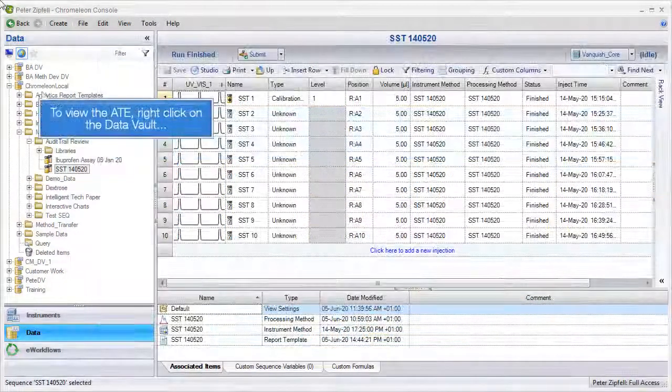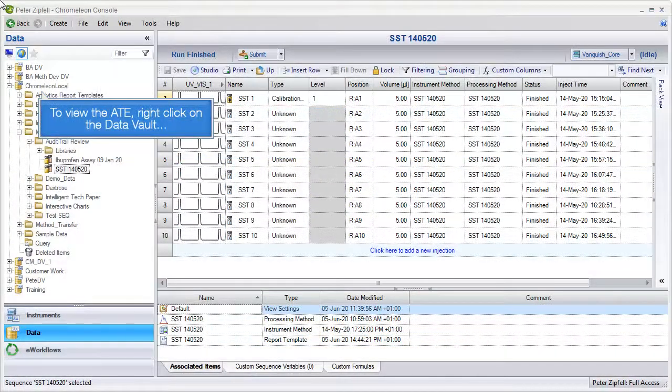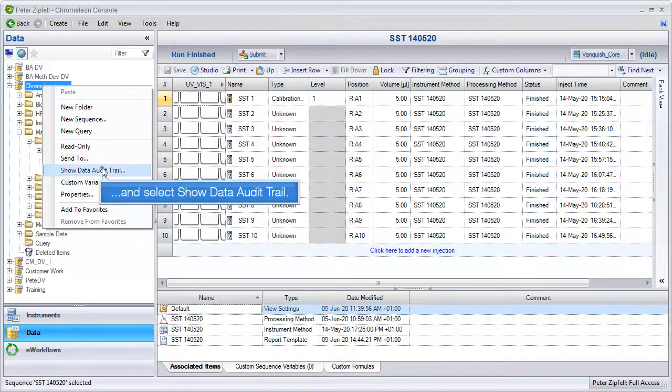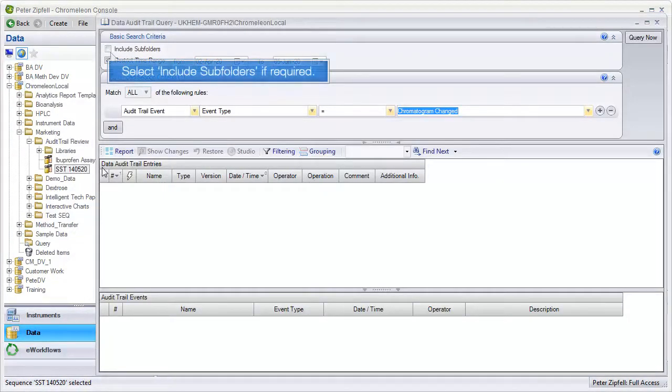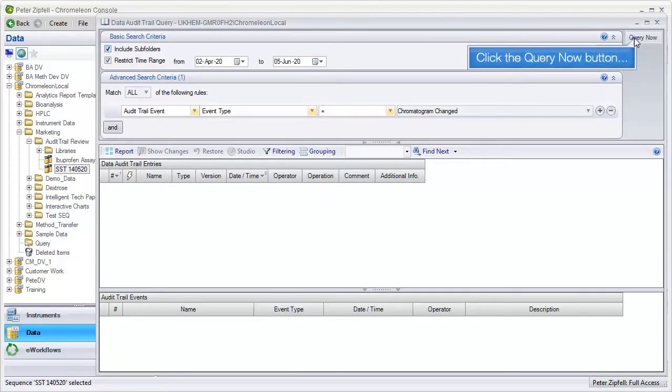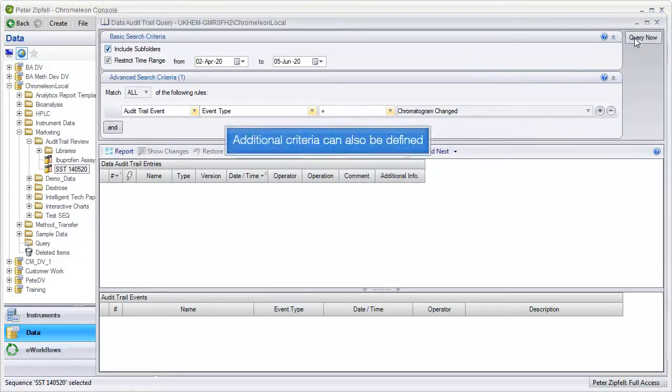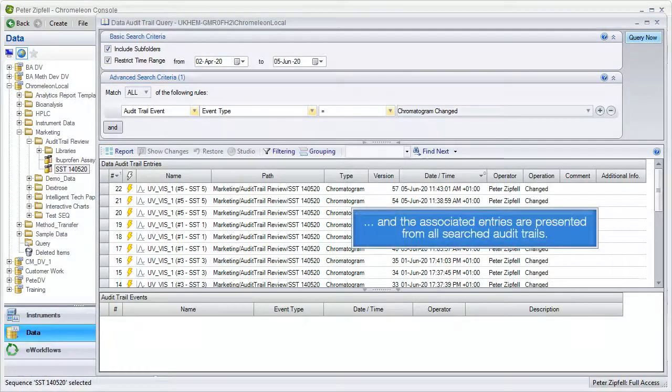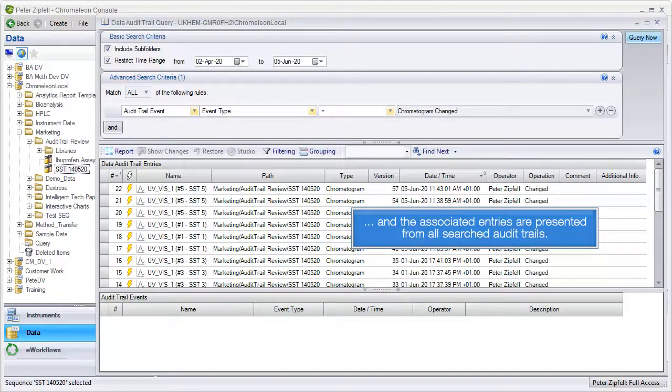To view the ATE, right click on the data vault and select show data audit trail. Select the option include subfolders if required. Click the query now button. Additional criteria can also be defined, and the associated entries are presented from all searched audit trails.